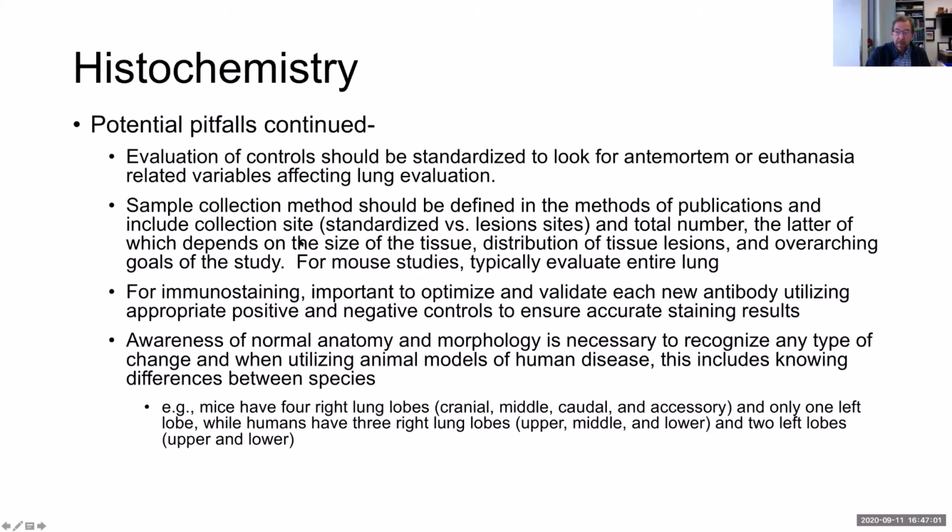You want to have the appropriate controls. And when you write a paper about this, it's helpful if you carefully detail how you did these things. So that's another point.